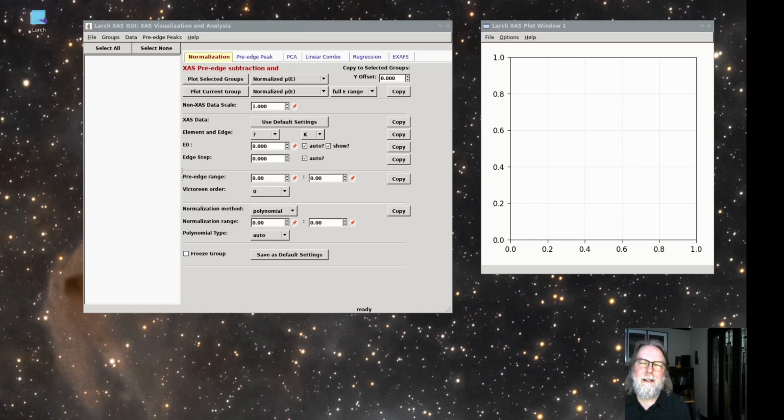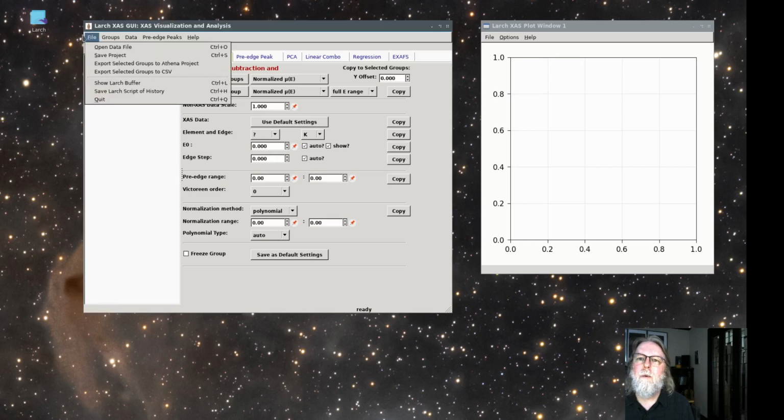It also means that linear combinations of basis spectra for two environments, say again, octahedral oxygen and sulfide, will accurately model a sample that has a mixture of those two environments. From a practical point of view, this makes XANES analysis very simple and allows a wealth of linear algebra methods developed for other spectroscopies to be used. So to start with, let's read in some iron XAFS spectra, always my favorite example, and we'll see how this works and how well it can work.